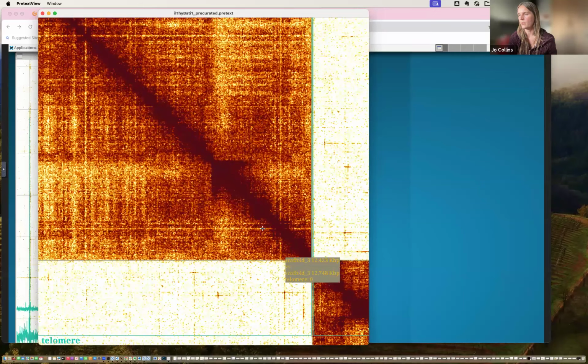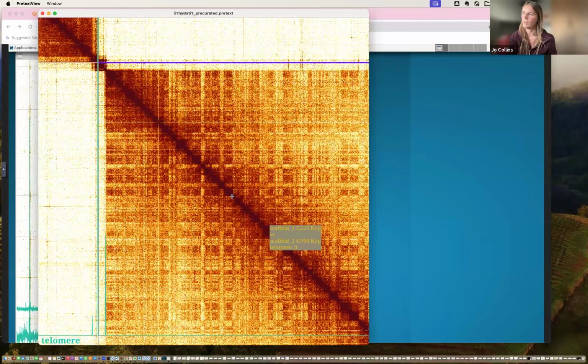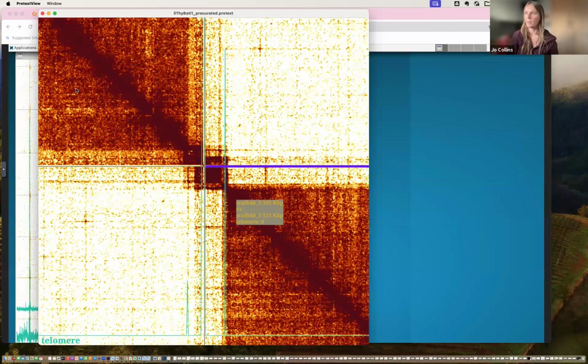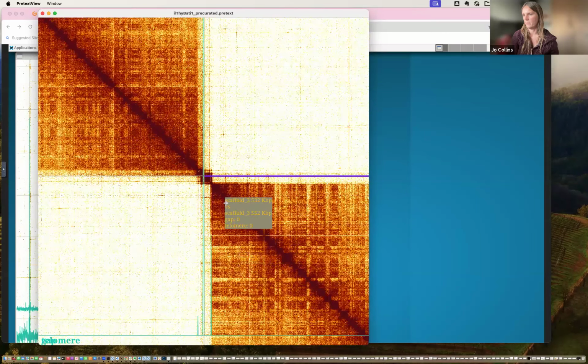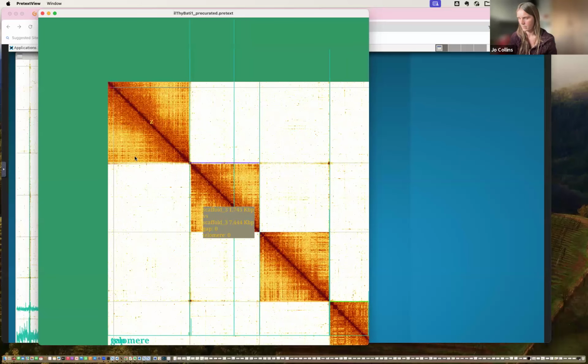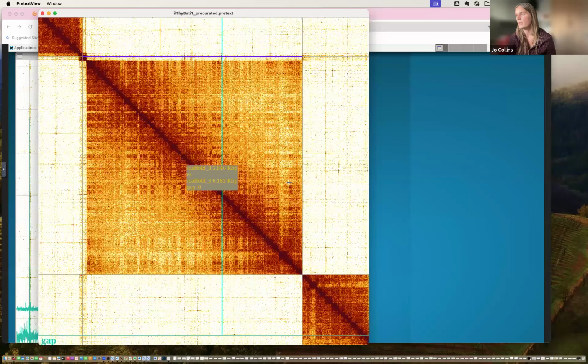And we're looking for that strong contact. And actually, in this case, we've got strong contact all the way through. That's this end of the map. It's not that one, sorry. Okay, right. Sorry, let's go.